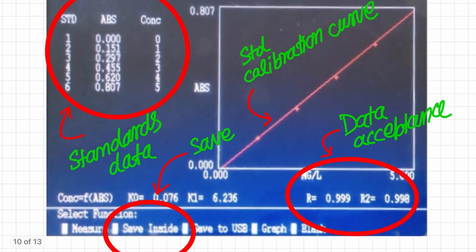So it means our whole analysis depends upon the standards, and how good your standards are will directly influence the results of your analysis. So if you have prepared standards by adopting good analytical practices, then the answer for your unknown concentration will be acceptable, reliable, and good. However, if your standards are not prepared well, then it will directly influence the results of your analysis.